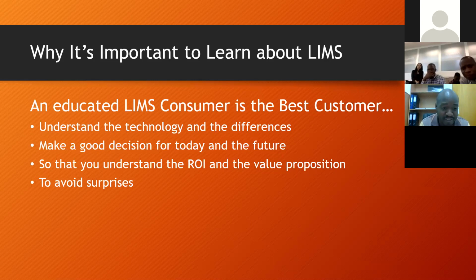This helps you avoid any surprises when the LIS is implemented. We've seen in many other places where users get surprised that, oh, this application can't do this. But if you have prior knowledge of what an LIS is, what you want to achieve, and the different platforms that exist, you can avoid this. Next slide, please.